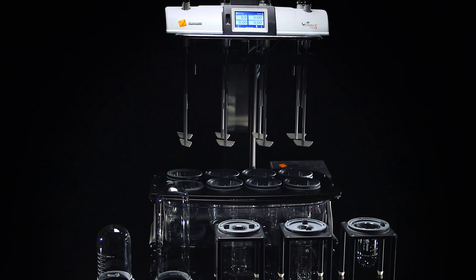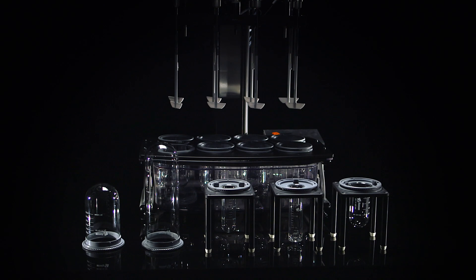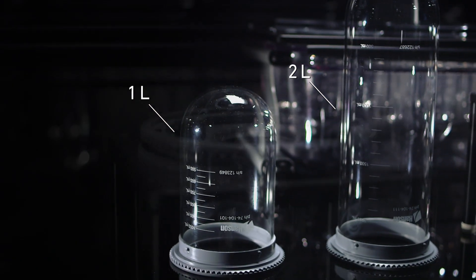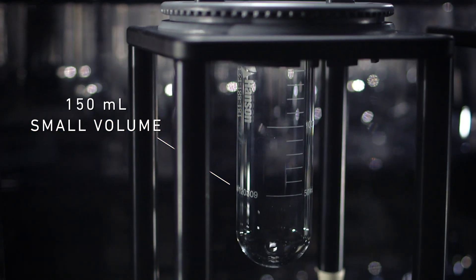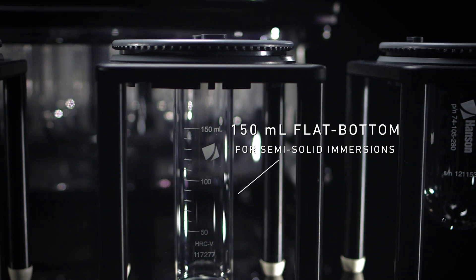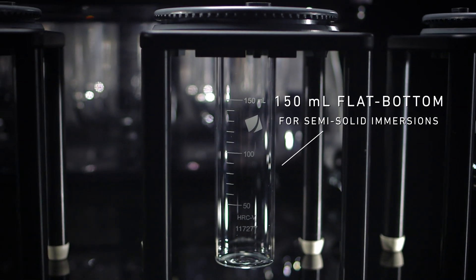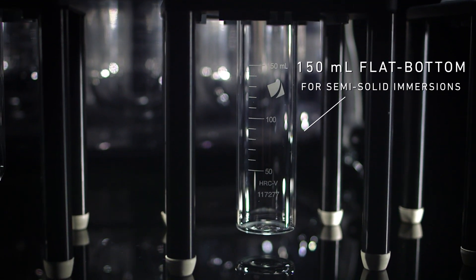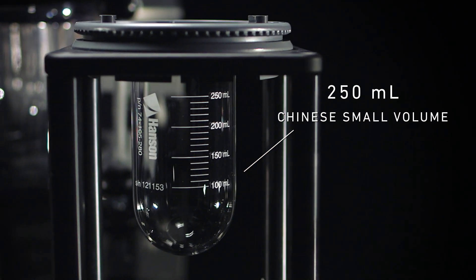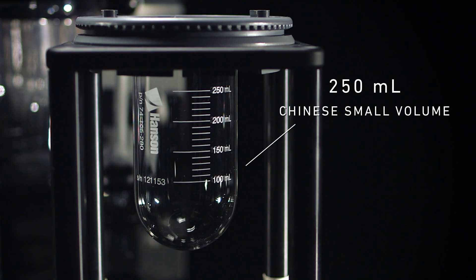The Vision G2 Elite 8 comes standard with the ability to change between various vessel types, including 1 and 2 liter, 150 milliliter small volume, 150 milliliter flat bottom for semi-solid immersion cell testing as referenced in USP Chapter 1724, and 250 milliliter Chinese small volume, which complies with the Chinese Pharmacopeia.